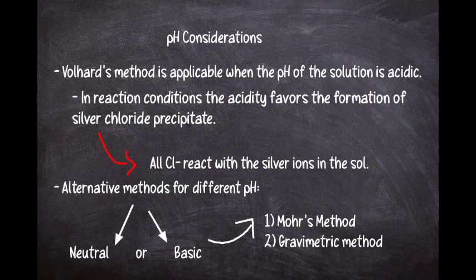This allows for the successful formation of the silver chloride precipitate during the initial stages of the process, ensuring accurate results in the determination of chloride ion concentration. It's a crucial consideration to keep in mind when applying this analytical technique in the laboratory.